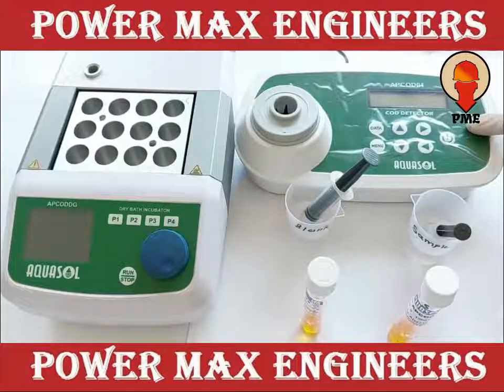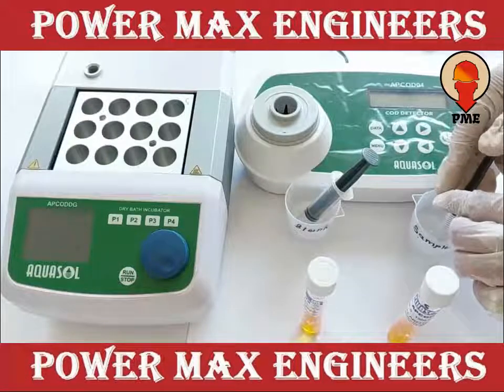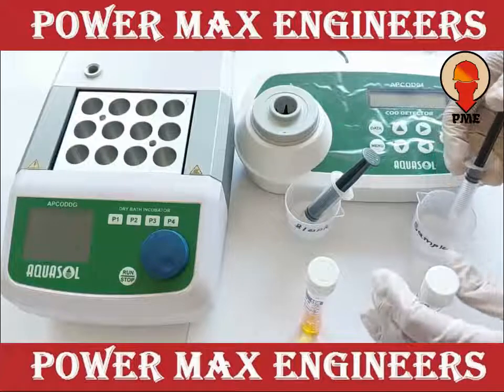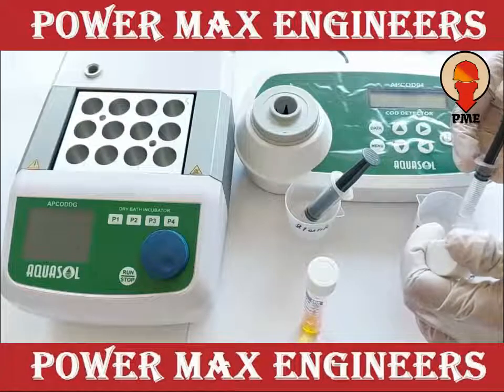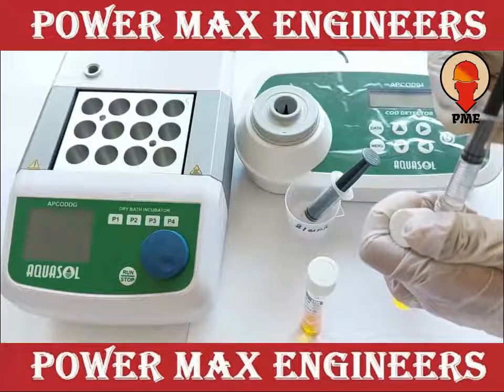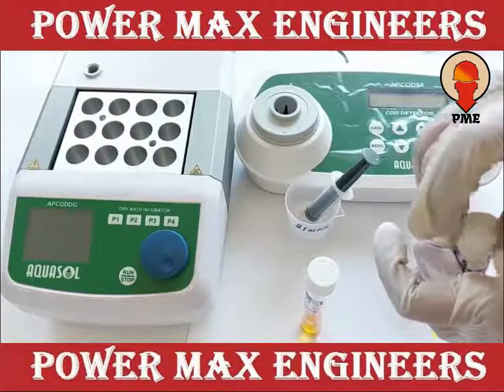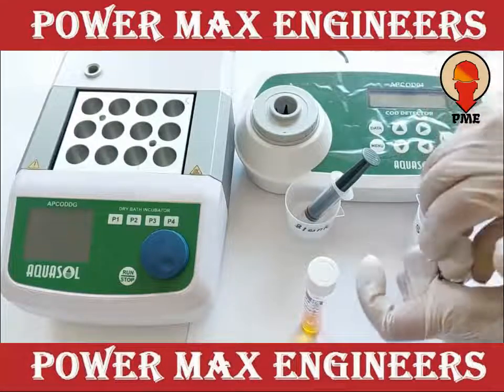Now we are demonstrating the COD test. We are using two vials: one for blank and one for sample, by addition of 2 ml de-mineralized water in the blank vial and 2 ml test sample in the sample vial.